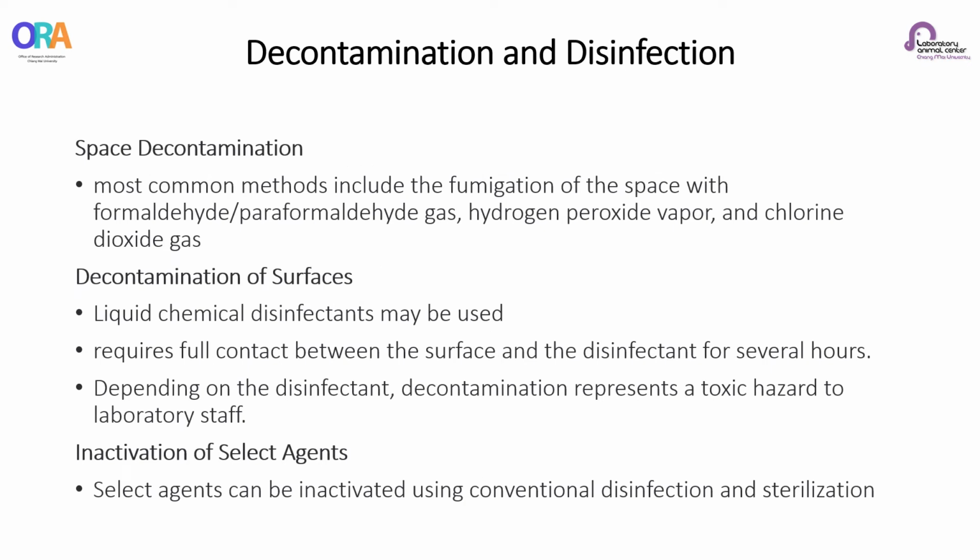Okay, the next is decontamination and disinfection. Decontamination renders an area, device, item, or material safe to handle in the context of being reasonably free from risk of disease transmission. The primary object of decontamination is to reduce the level of microbiological contamination so that transmission of infection is prevented. The definition and capabilities of each inactivation procedure are discussed in Appendix B.